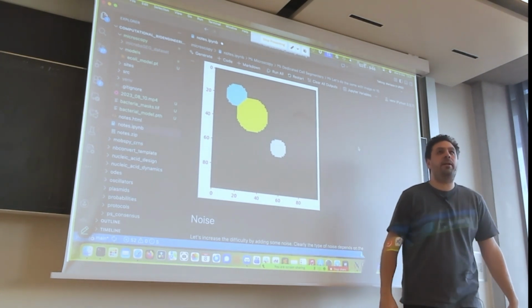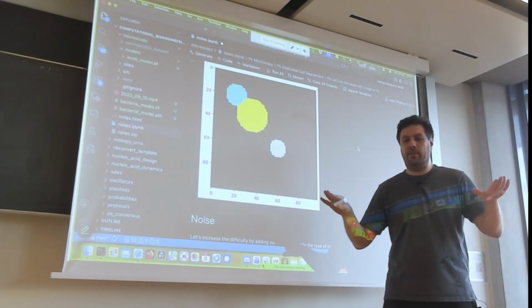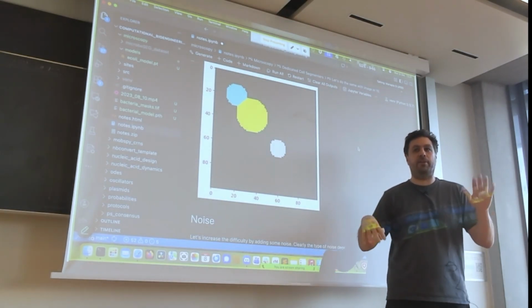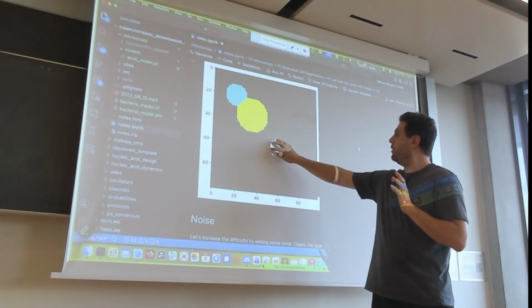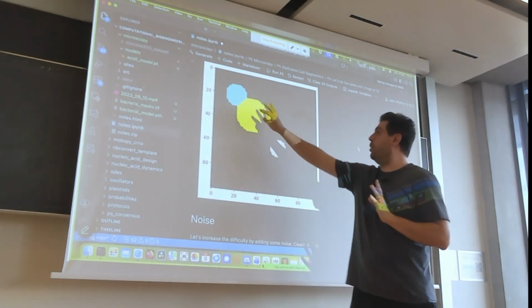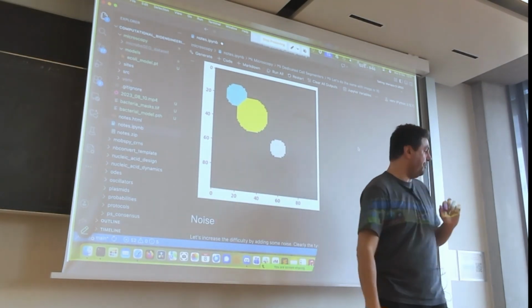So we kind of assumed a perfectly thresholded black and white image for this. So it cannot deal with any grayscales. We really knew this is the object, this is the background, this is an object, this is an object. The only problem is they are touching, but otherwise they are objects.